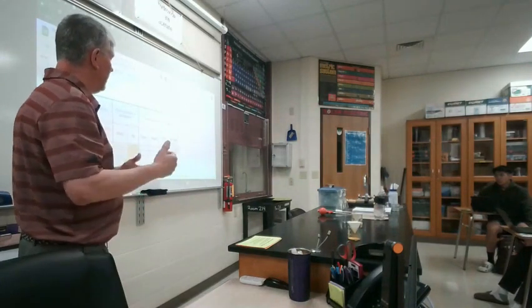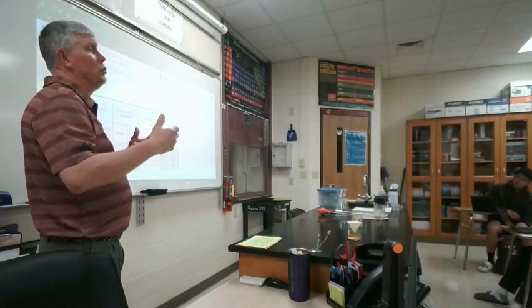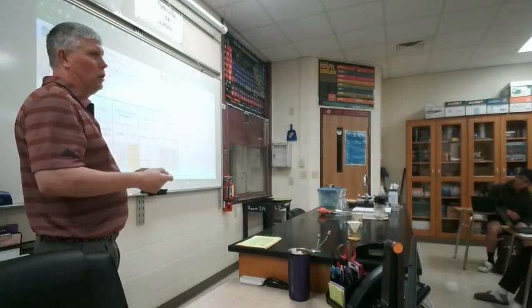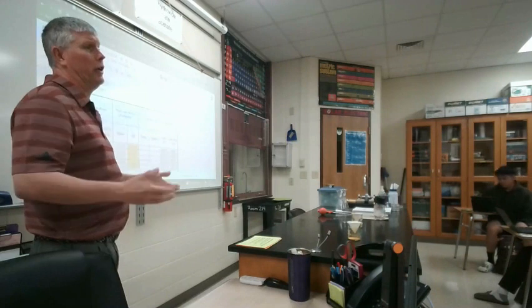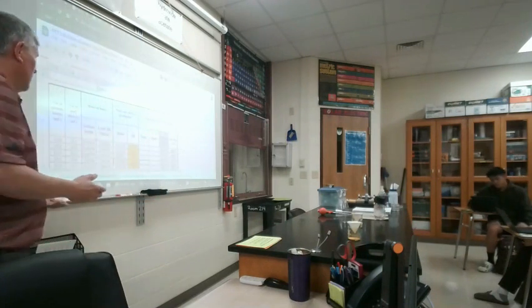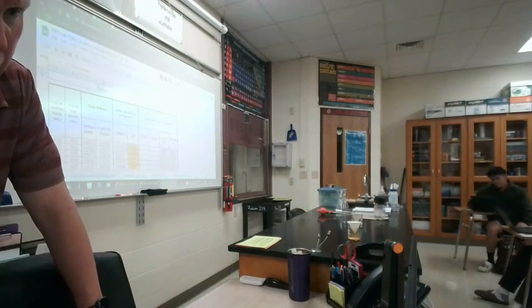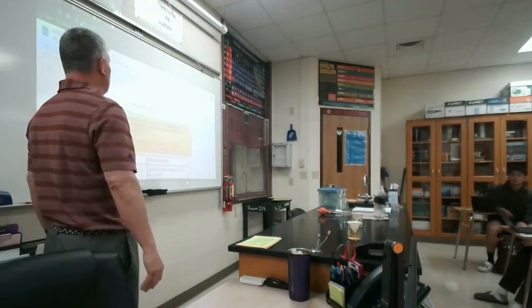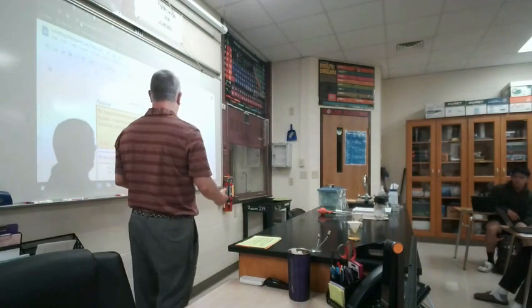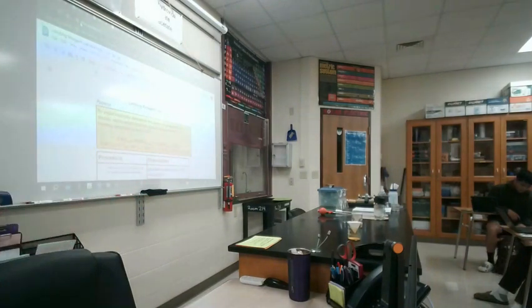Okay? Once they get their information in here, I'm going to lock the assignment so that you can then make your individual graphs from it. I'll repost it out there as a copy for each of you eventually. Okay? So you can't do anything with that until then, ladies and gentlemen. All right? But today we got to get the lab actually finished. So we are going to experimentally determine the grams of precipitate in a double replacement reaction shown below and find the limiting reactant in each trial. You've already done that. We already know which one is the limiting reactant, ladies and gentlemen.